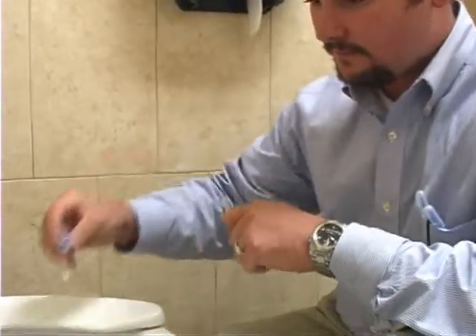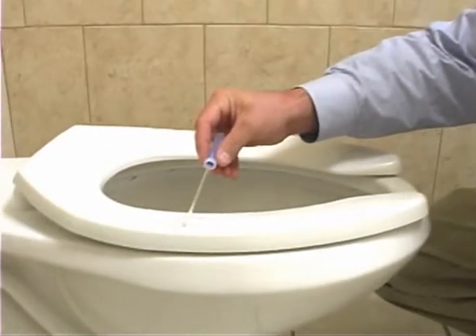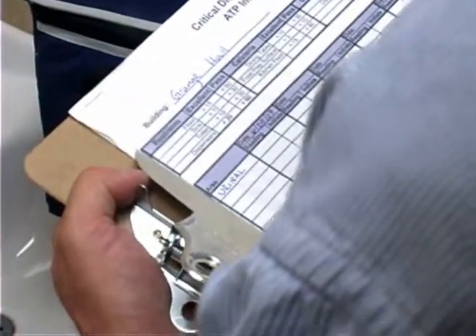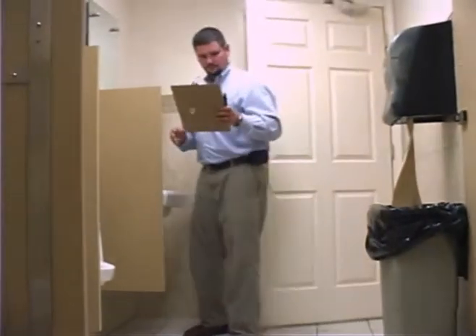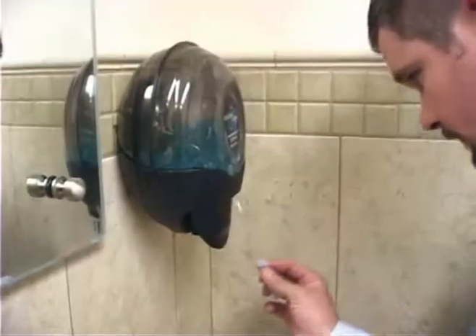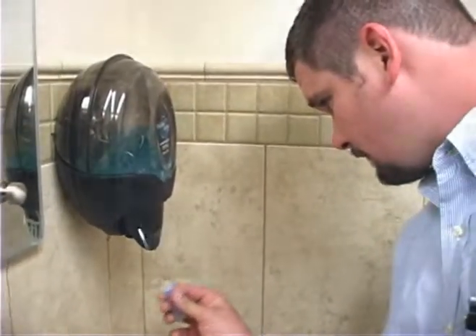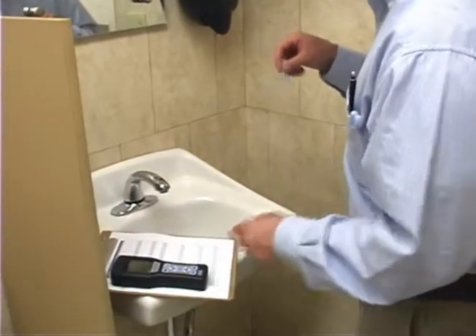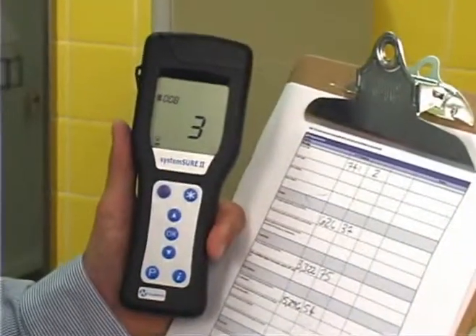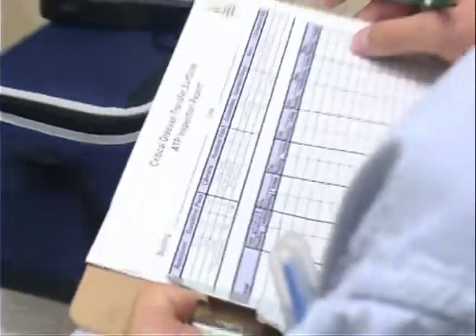With ATP monitoring, it's now possible to establish a quantifiable standard of hygiene that defines when a surface is really clean for different areas throughout your building. This video is designed to demonstrate the process of using the ATP monitor to measure cleaning effectiveness. While this device is very easy to use, it is a scientific instrument that requires special attention. It is important, therefore, that you understand and follow these instructions carefully to attain quality results.